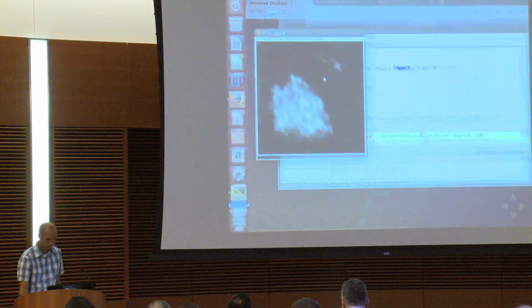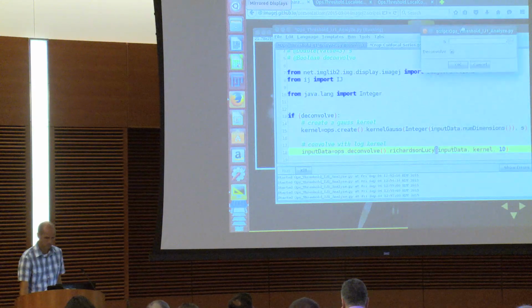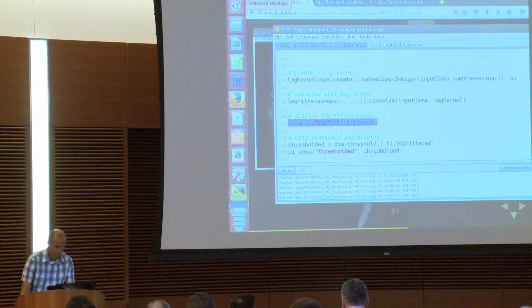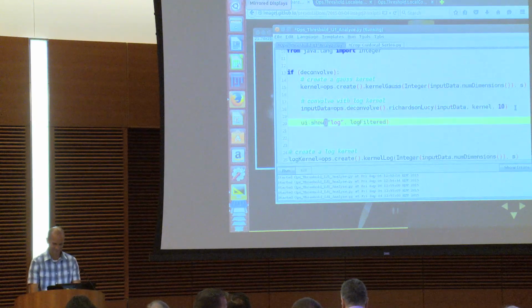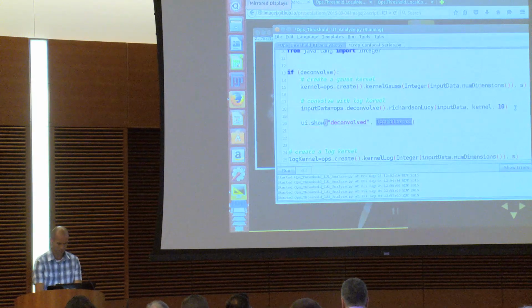Let's make sure this guy is highlighted. I'm going to cancel this, because there's one other thing I should do here, just to make sure. Let's just show it here to see.